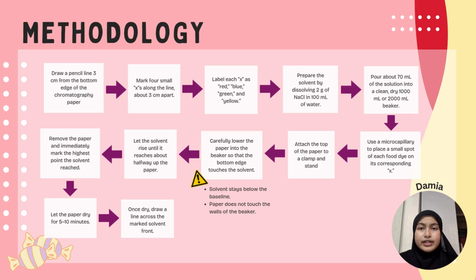Before we move on to the results, which will be presented by Qistina, we will now watch a video demonstration of the chromatography experiment to better understand how the process works in practice.